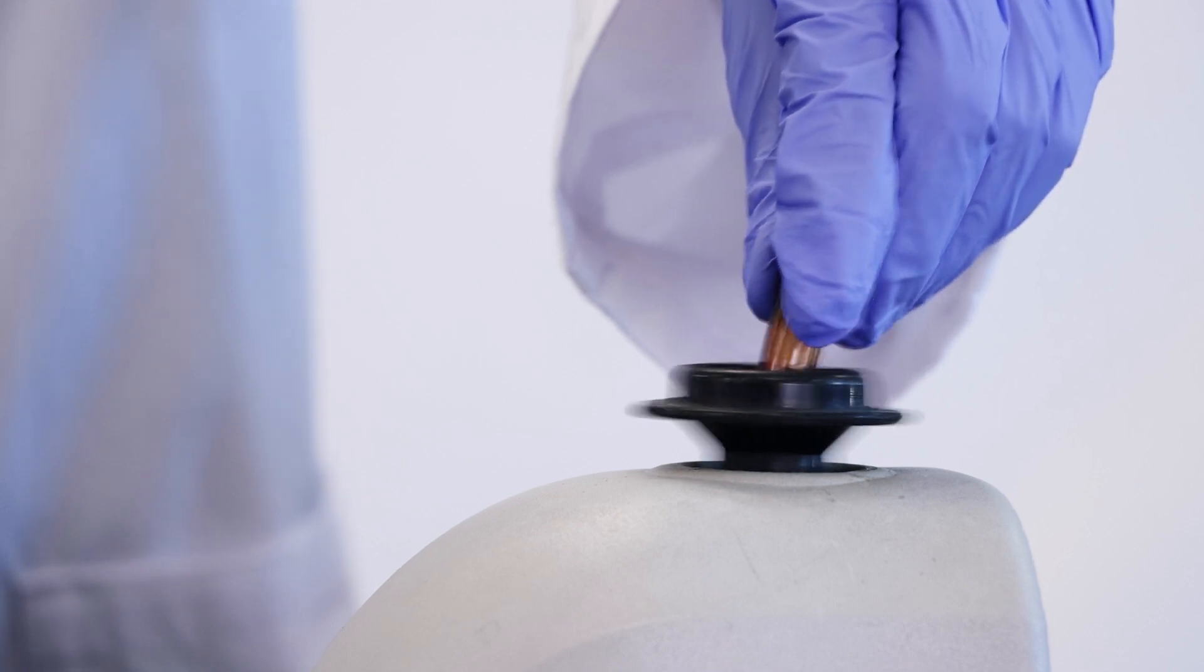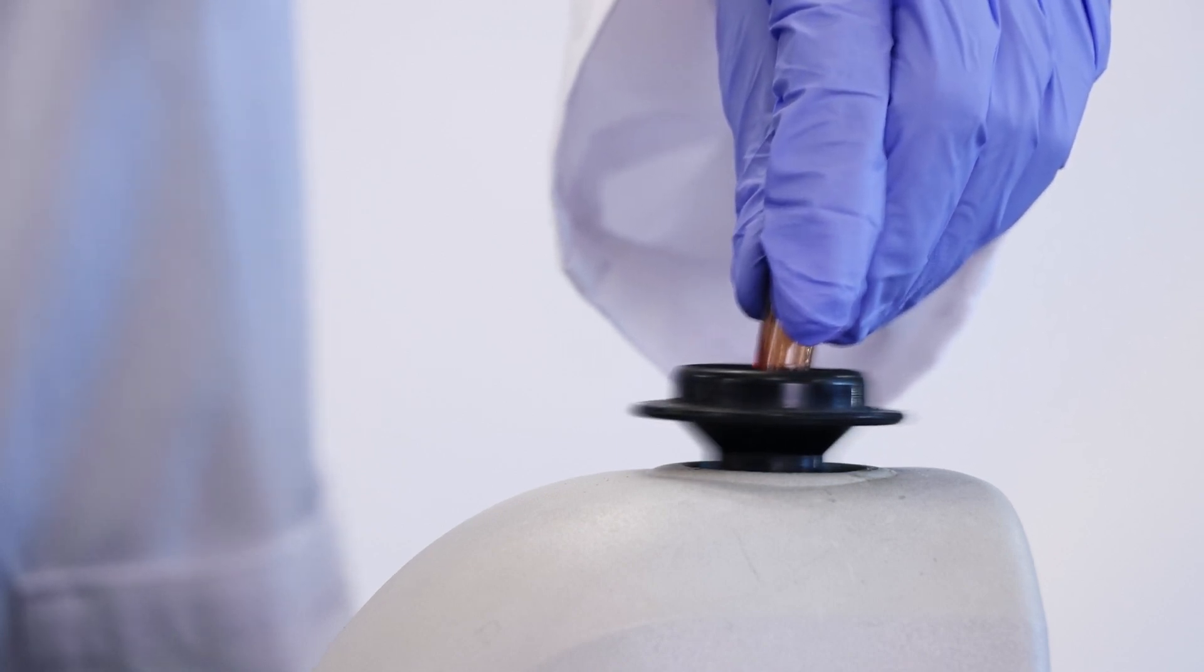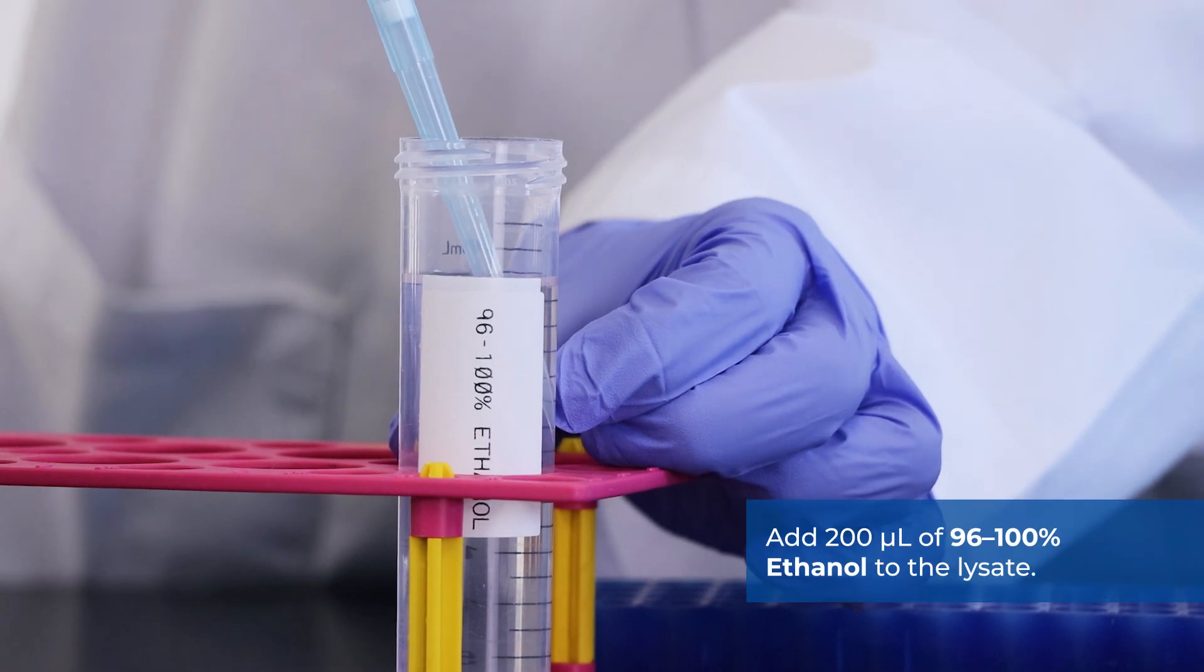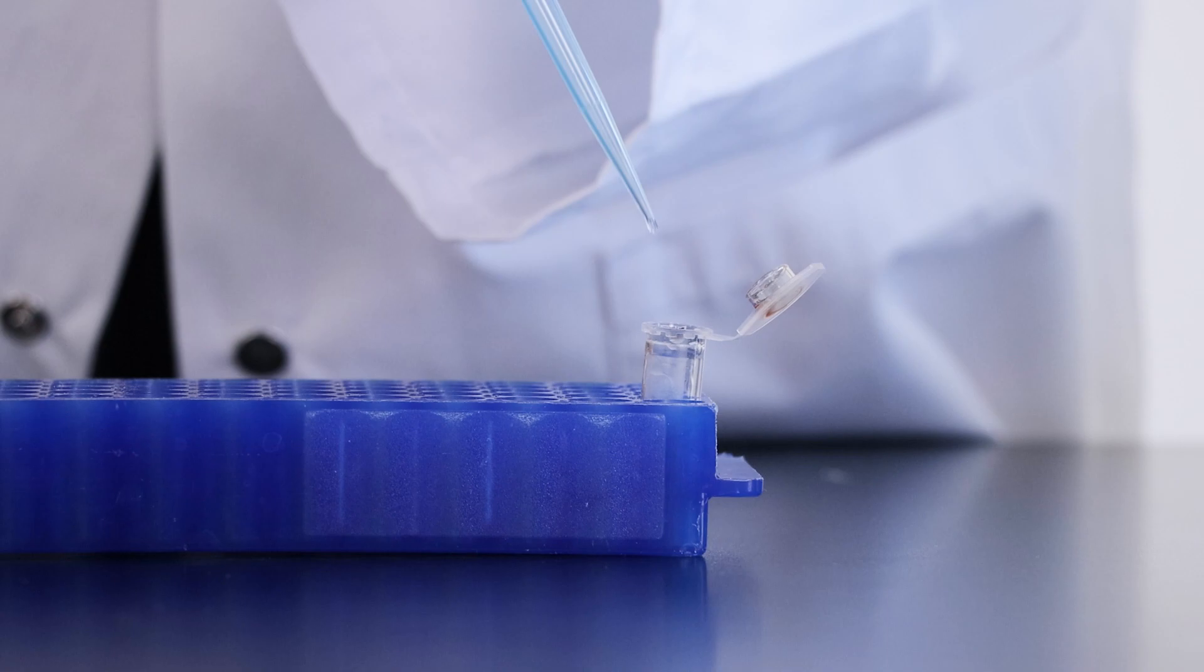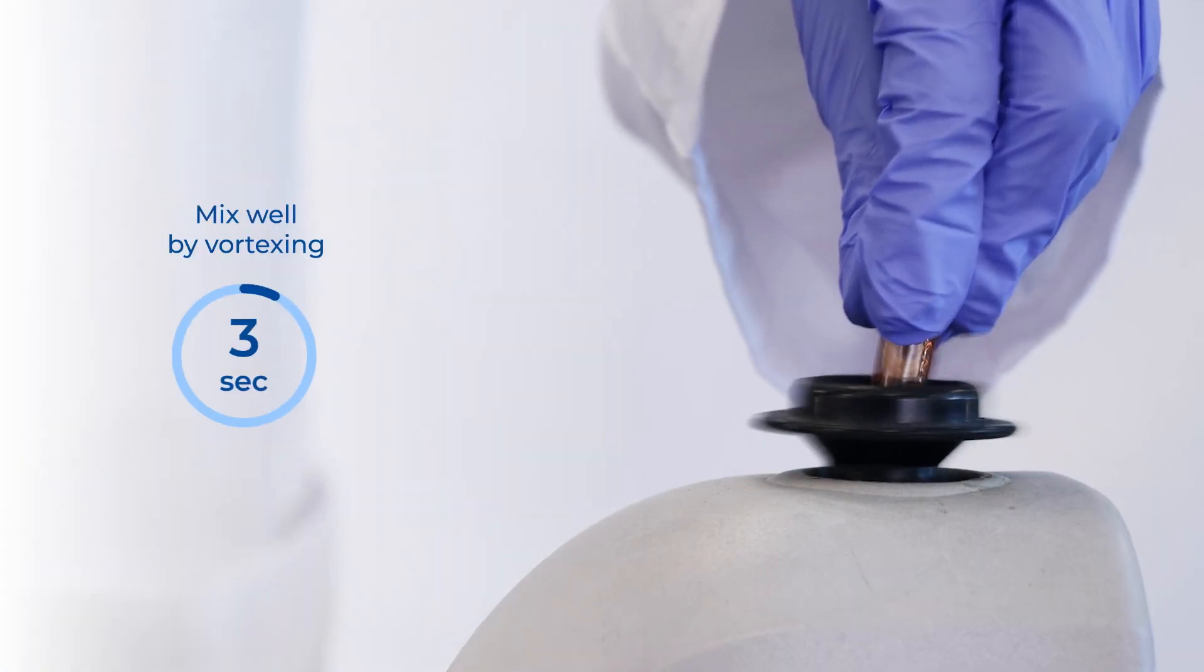Ensure that the mixture becomes a light red color before proceeding to the next step. Add 200 microliters of 96 to 100% ethanol to the lysate. Mix by vortexing for 10 seconds.